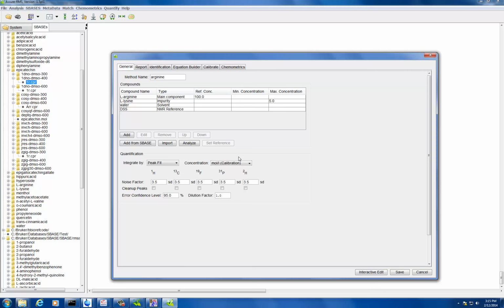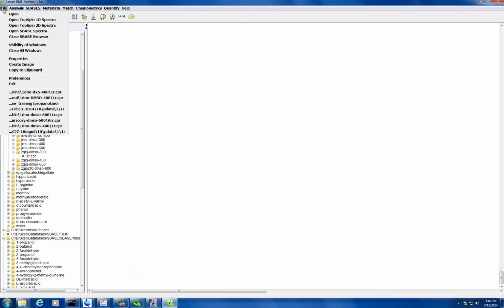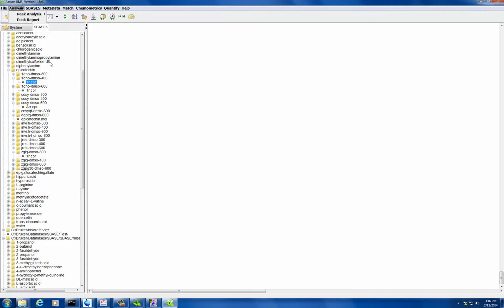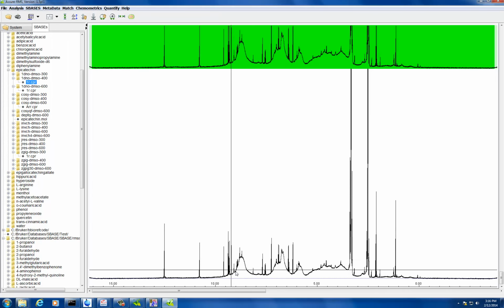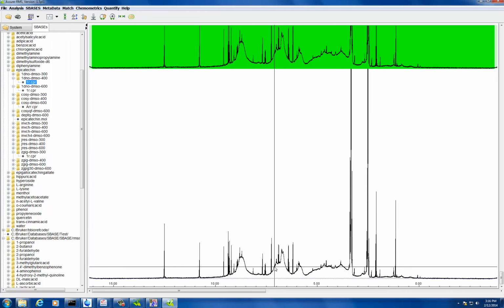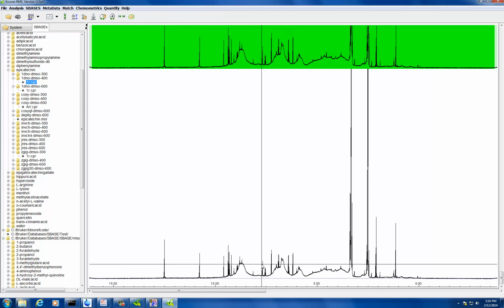But, well, there's two ways. One, obviously it's nice to identify it, but for example, if you really don't know what your sample is, but you know that it's maybe 1 or 2 protons in certain areas, then you really don't always have to match it to a species. You can just define this as one area, this one area, but you still need to know how many protons are there. That's the only thing you need to know, and that's, I guess, the harder part more than anything.